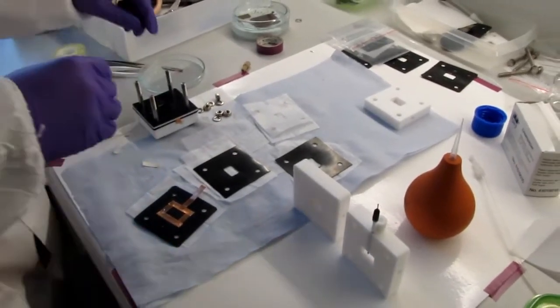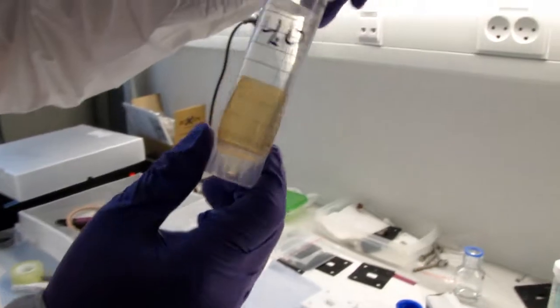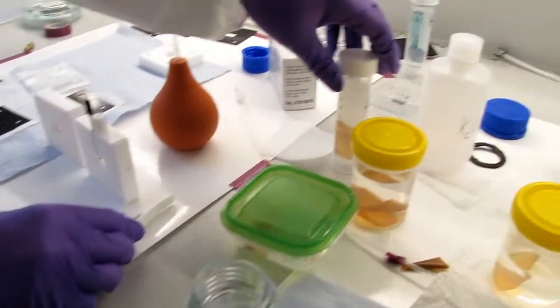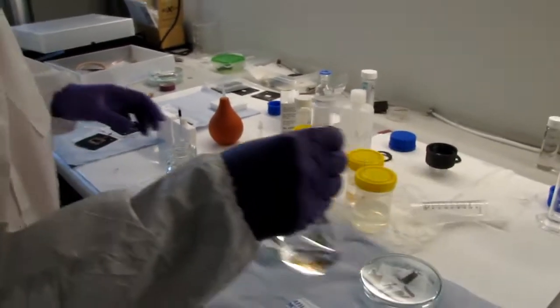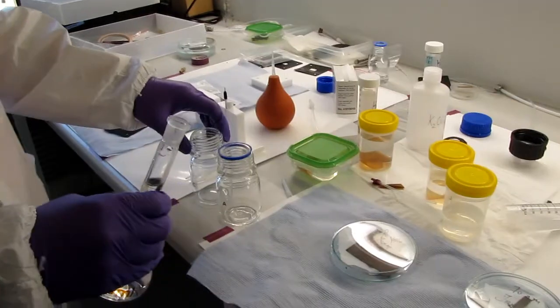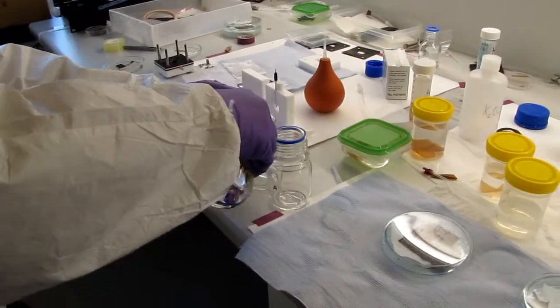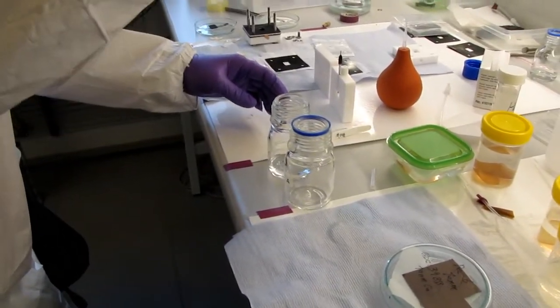This is the membrane already immersed in the deionized water. Maybe later I'll put in my membrane. I first fill the electrolyte, one catholyte, one anolyte. Already dissolved. See?